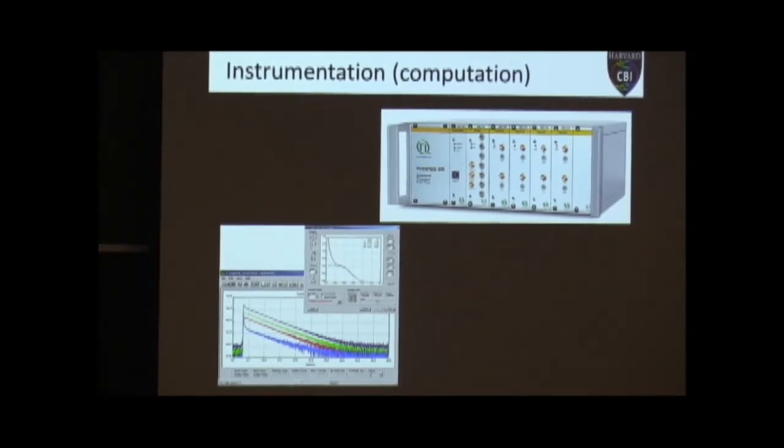So this box gets a signal from the laser when the laser fires that pulse, and then it collects all of the signal coming off the detector and puts those into little time gates. Okay. And sort of syncs all of that all together. And then, of course, we need some software so that we can interact with this and actually display our data. So those are the last two important things that we need as far as equipment goes.